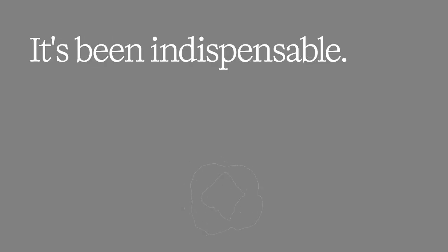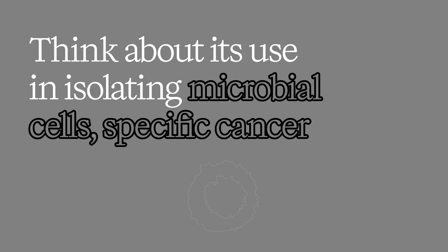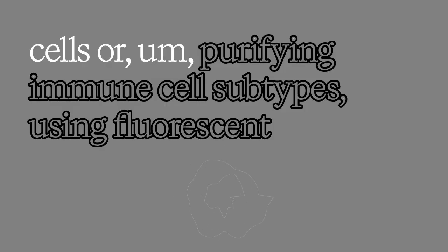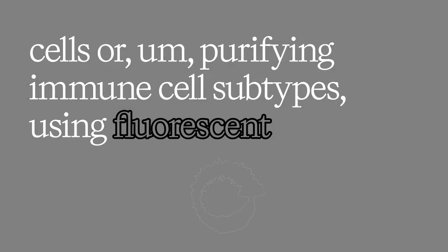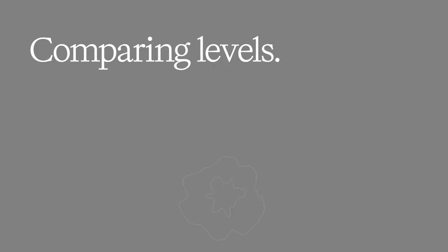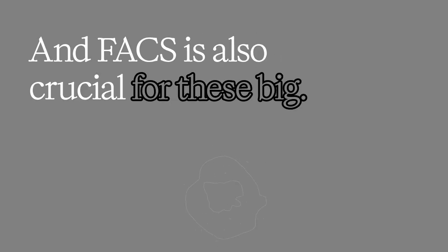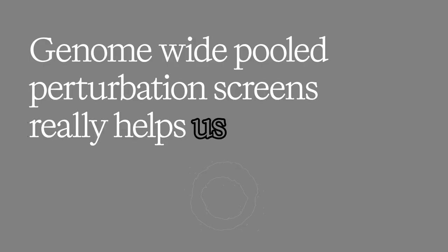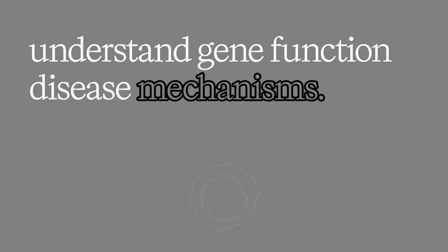It's been indispensable, really. Think about its use in isolating microbial cells, specific cancer cells, or purifying immune cell subtypes using fluorescent antibodies to compare, like, how much protein is on the surface. Right, comparing levels. And FACS is also crucial for these big genome-wide pooled perturbation screens. Really helps us understand gene function, disease mechanisms. It's been a workhorse.